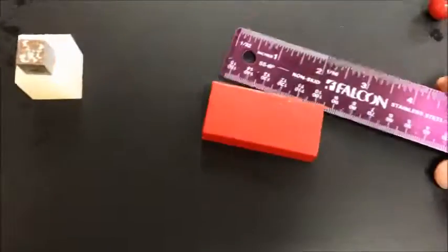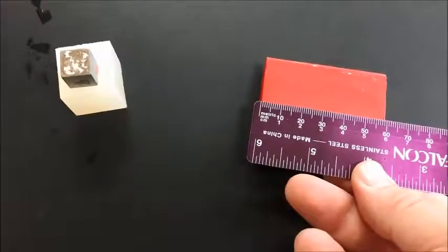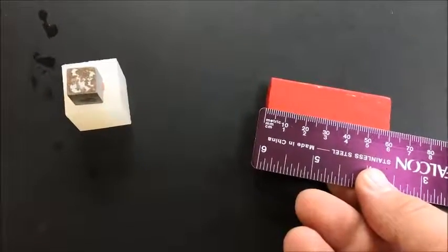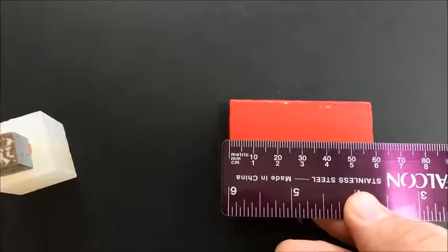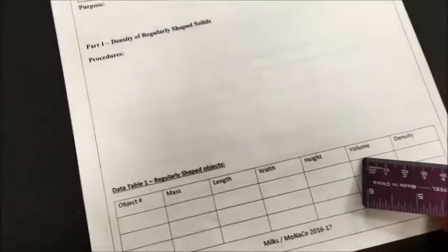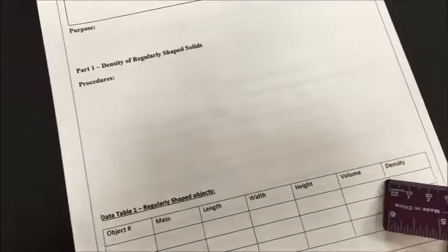When you're doing length times width times height, you have got to use centimeters. And make sure you line it up properly. Don't use the edge of the ruler. You're going to be inaccurate. You want to line it up so you're measuring the length of it in centimeters. This one appears to be about 6 centimeters. So that would be my length. I'd write it down. I'd do my width and height. I'd calculate the volume by multiplying the 3. Then I'd divide the mass by the volume to get the density.